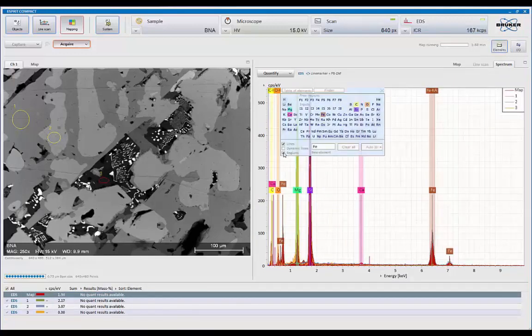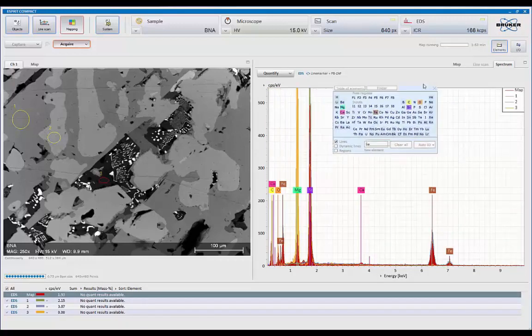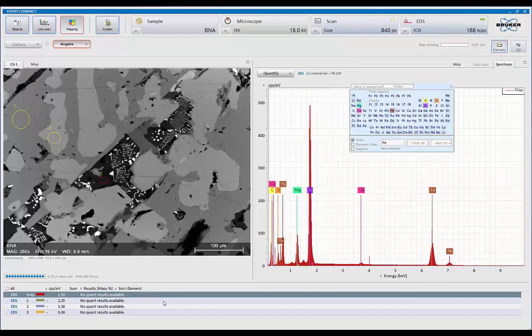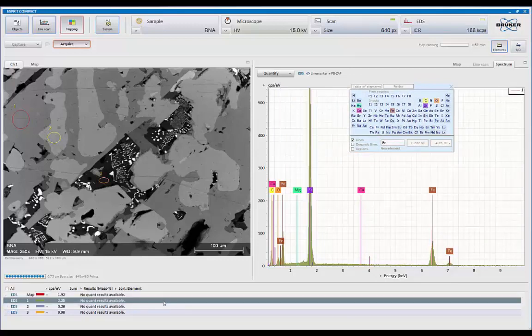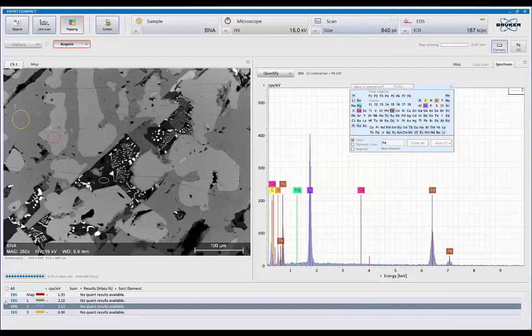Let's bring the periodic table up. I'm going to turn the ROIs off so we just see the peaks. And what I'm also going to do is just look at the individual ones. So this is region one we see as the silicon-iron area. Region two, again, silicon-iron, but now there's more iron and less silicon than the first region. We overlay the two. That becomes rather obvious.